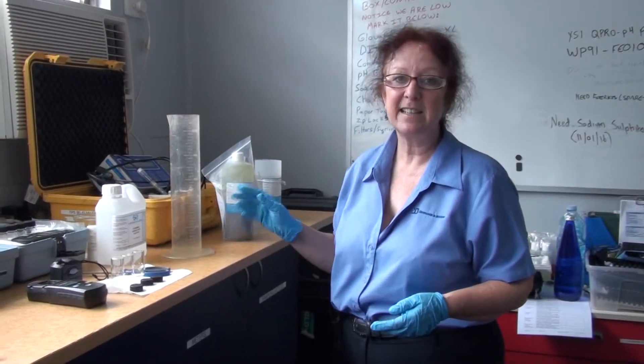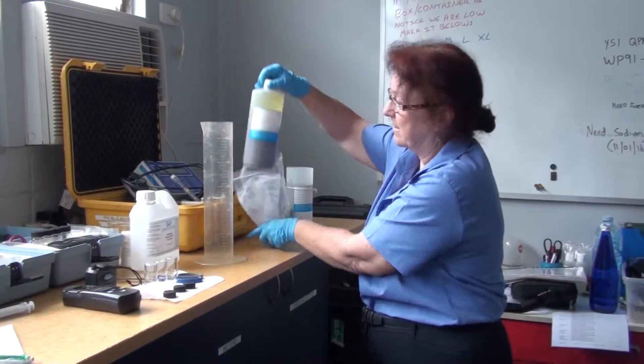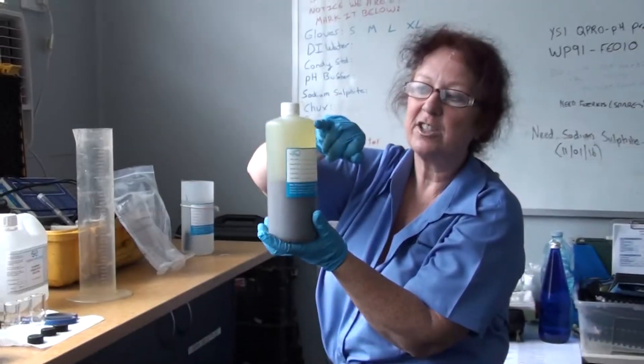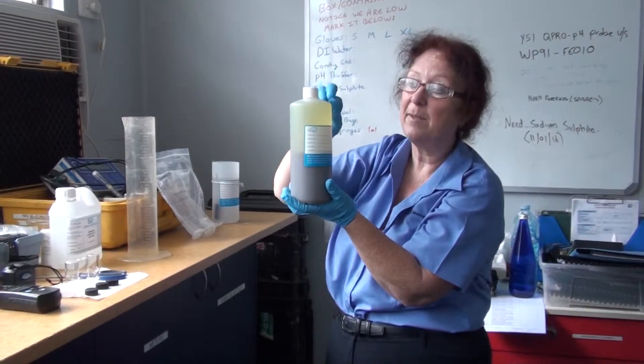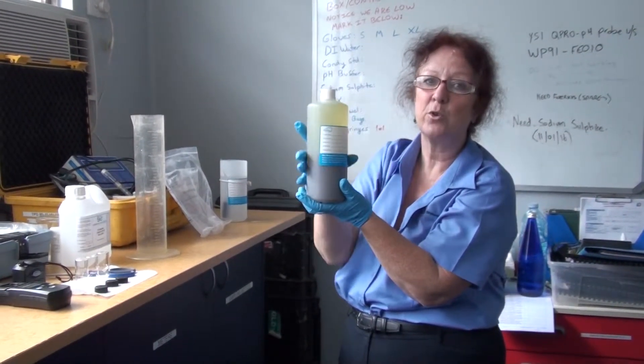Hi, I'm going to show you how to do a mixed liquor settlability test. It's pretty important how you handle the sample when you're actually pouring up your cylinder. If you get the sample — you can see this one has actually settled out quite a bit in transit — ideally you would only fill that sample bottle to the shoulder, not right up to the top, because by having that little bit of air space, it makes it easier to remix and get a truly homogenous sample to test.